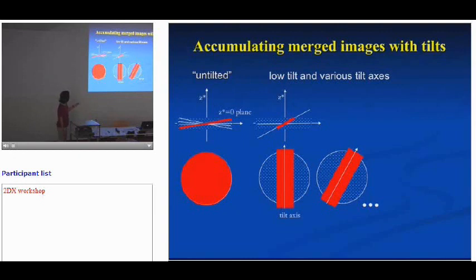When I tilt like this, the resolution range in my reciprocal space will still lie within this box that we assumed from the beginning gives us the same value. So you can use that value to find the correct phase origin of the tilted image using this part, and once you apply that origin, you end up with information from the region outside this zone.